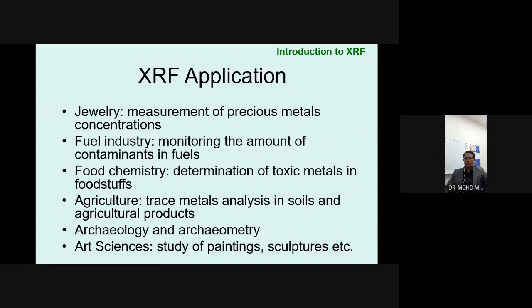He is basically measuring the purity of gold. Okay, so we know that all the jewelries are very precious. And what are actually the methods of identifying the fake gold or the real one? So what Adlan is doing is optimizing some sort of algorithm, comparing it with the assay method.